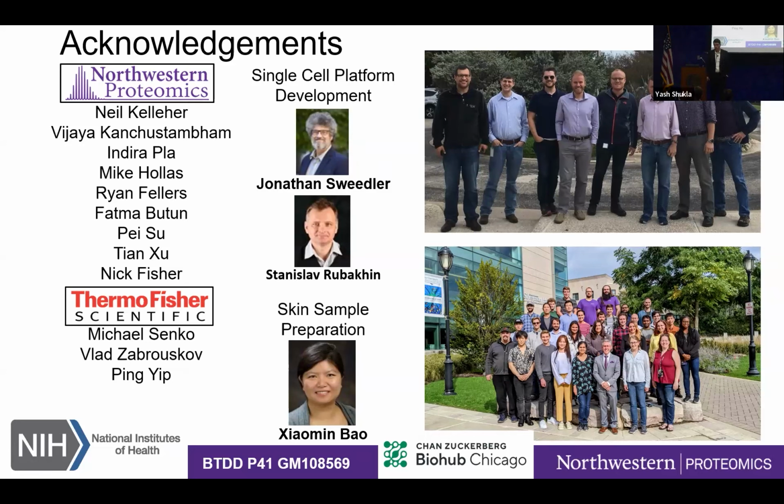Thank you very much for a great introduction to single cell imaging. I'm curious, of course histones are very abundant in most of these cells. Have you looked at different solvent mechanisms for potentially biasing to different parts of the cell, like specifically membrane ones, more hydrophobic, or detergents in your solvents to extract that information?